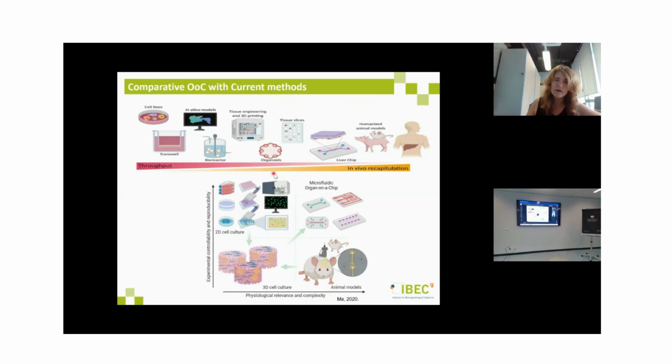Comparing with 2D cell culturing, which is less relevant but easy to make more reproducible, we have the evolution of the combination of these two technologies: the 2D cultures modified to 3D cultures and evolved to the organ-on-a-chip systems, where we have the 3D culturing inside a chip, and we are also using other advantages such as the shape, the microfluidics, and the sensing.